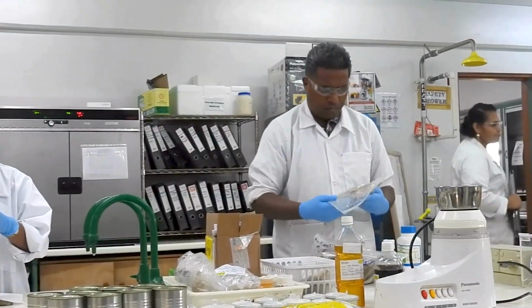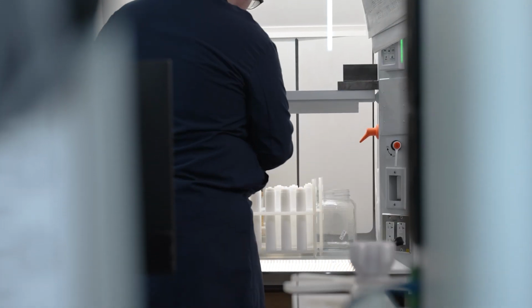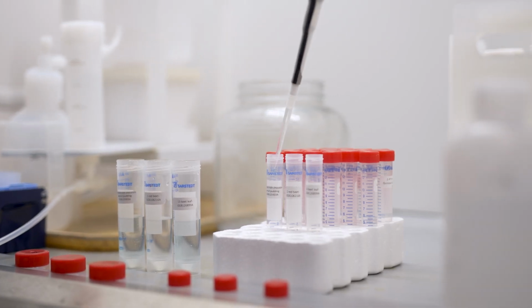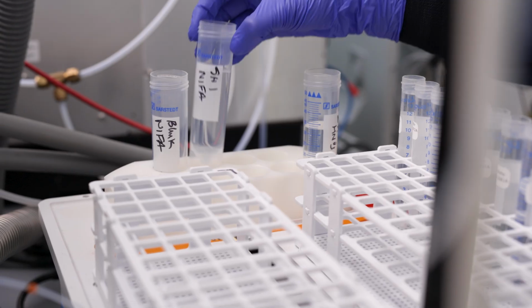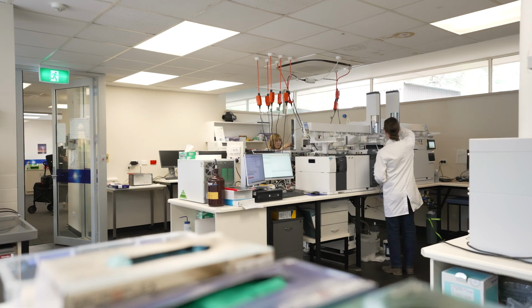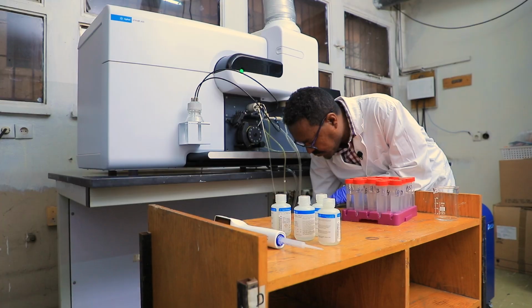The PTFI has developed a reliable and adaptable ionomics method that is based on commonly available instrumentation. This method allows us to quantify dozens of biologically relevant elements in diverse food matrices, even though the concentration of these elements vary over broad ranges.